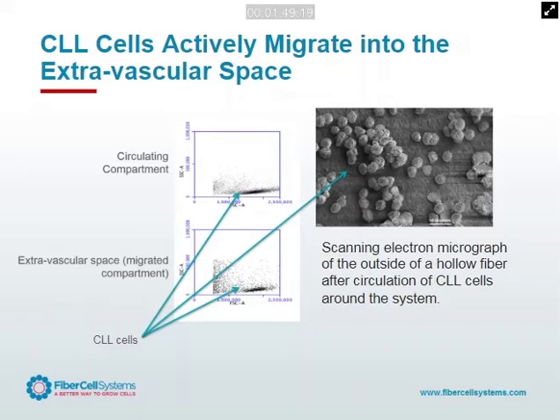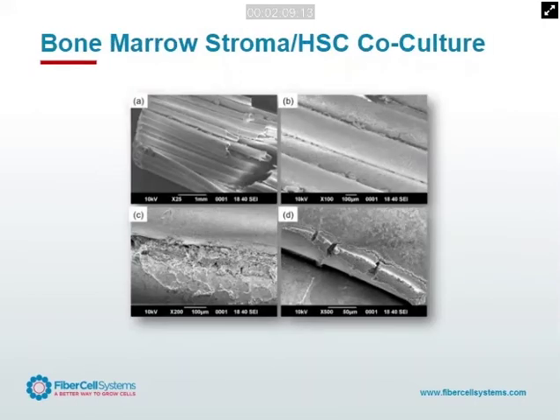And the two things that are important about this particular model is, number one, it's a way to get enough endothelial cells and enough of the circulating leukemic lymphocytes so that you can do genetic analysis, you can look at protein expression, you can look at receptor activation with enough cells here. It's about 80 square centimeters of surface area. And secondly, this process is quantifiable. So they can put in drug X and say, okay, we saw 80% reduction in cancer metastasis utilizing this drug.